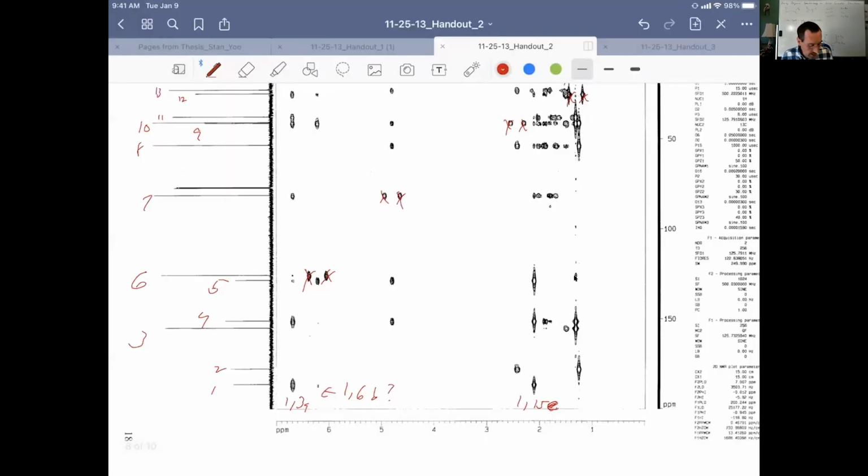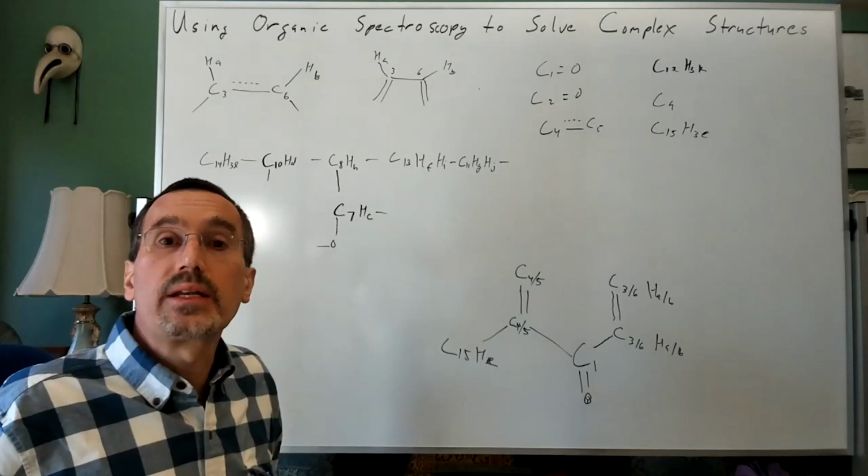All right, so I'll continue with this idea of focusing on isolated peaks like the carbonyls. So let's focus on carbon number 2. Carbon 2 is crossing with 10D, and carbon 2 is crossing with 14L. So that again is really, really telling because that places our carbonyl number 2.